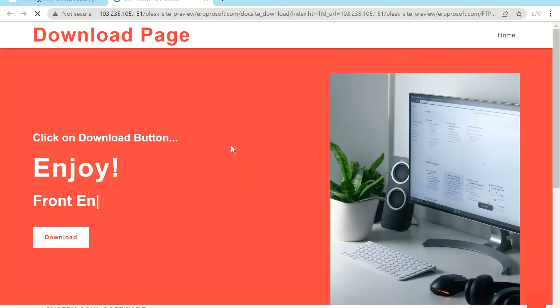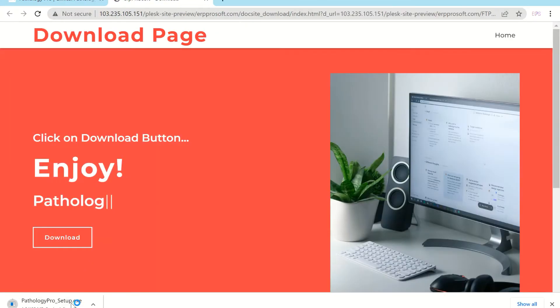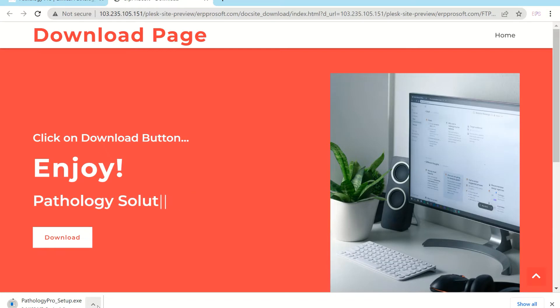Click on Download button and wait until download completes. This software supports multiple report style formats with QR code. Reports can be printed or exported to PDF.